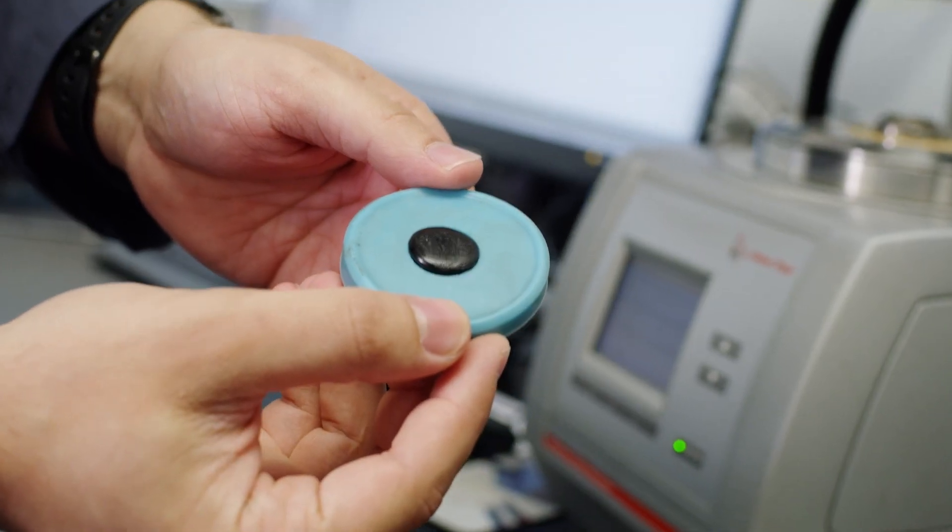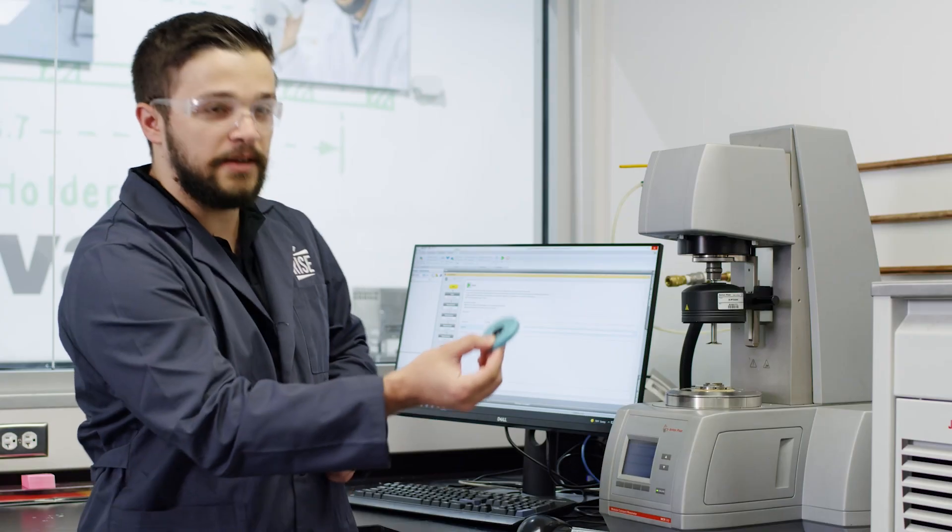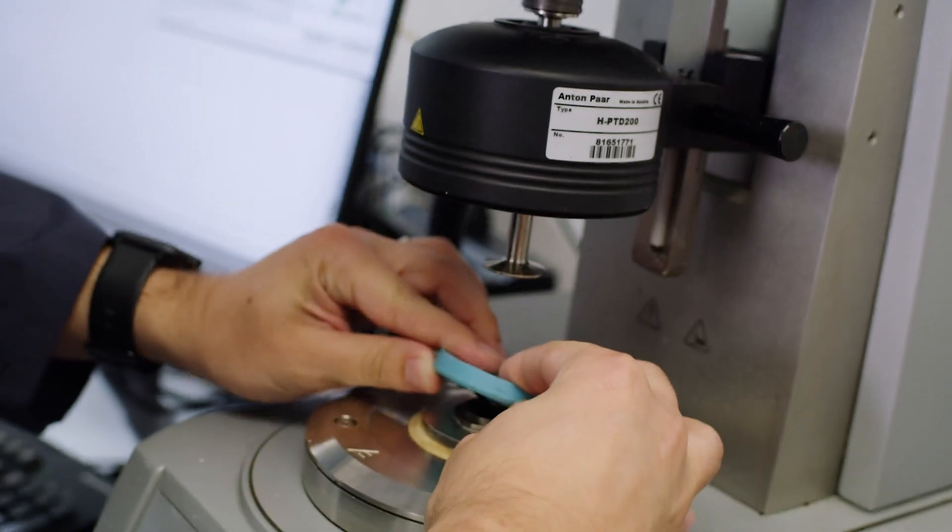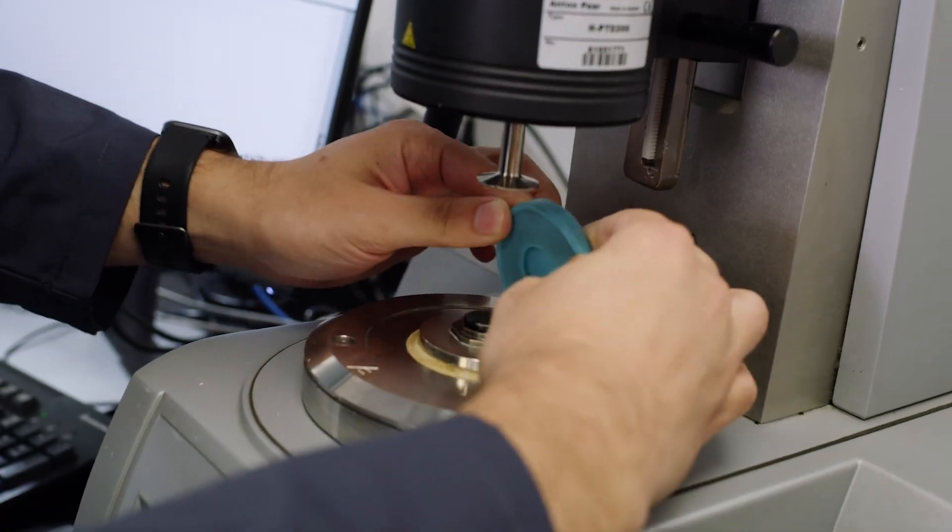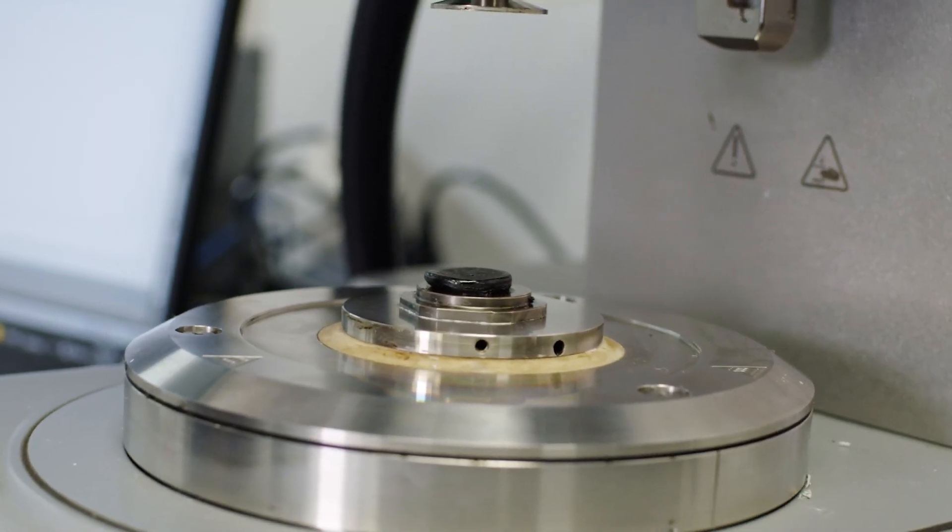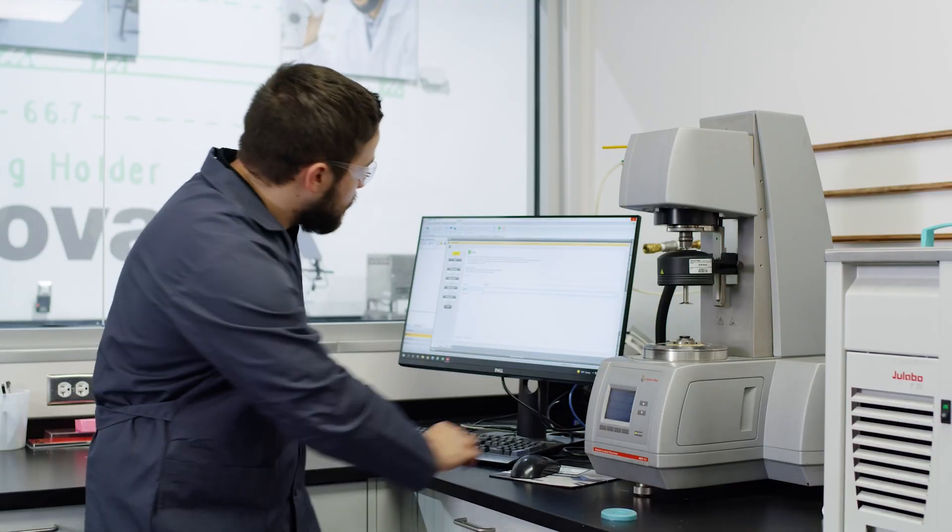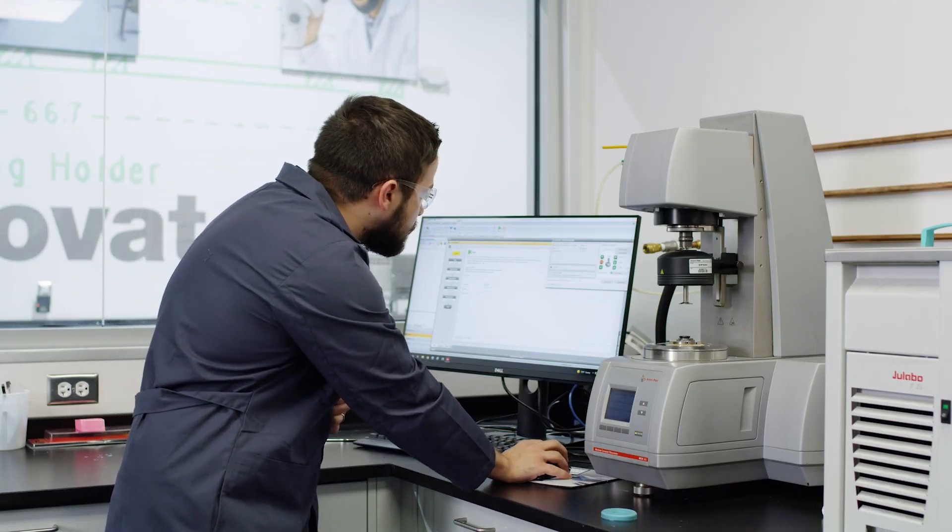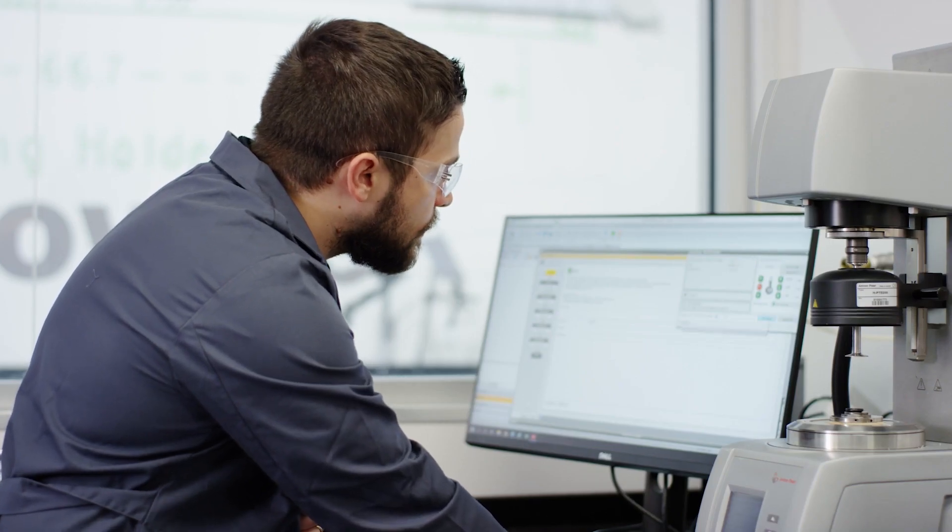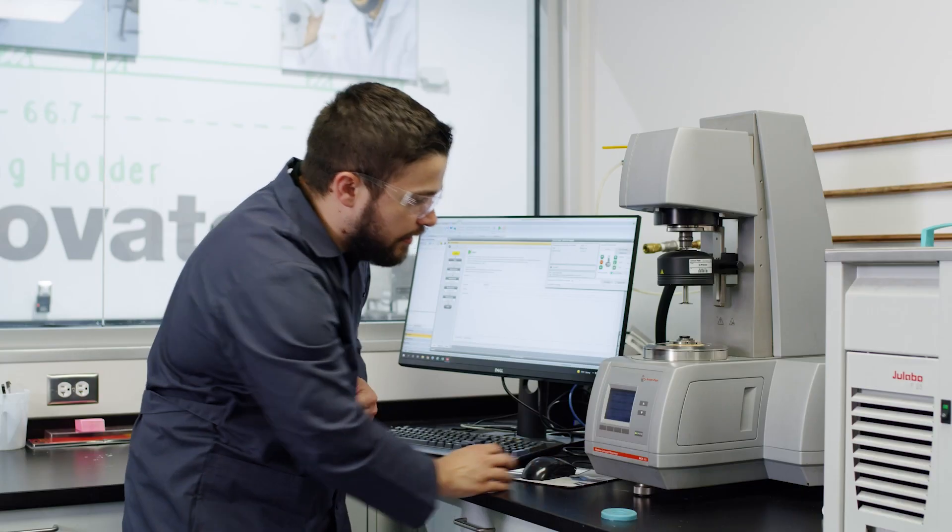We load our samples in these molds and pour hot bitumen into them. Then we set it into the DSR here, press it down, and make sure it's centered. We raise the temperature to about 90°C and let it heat up.